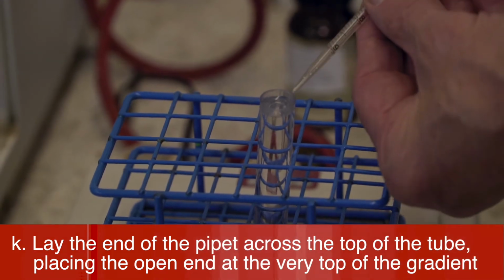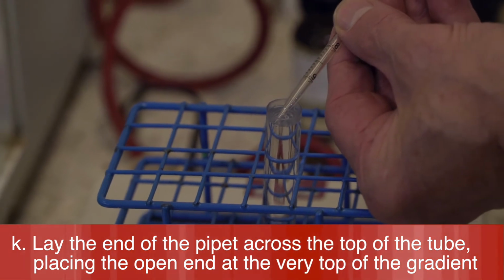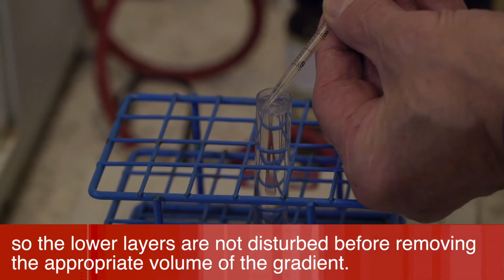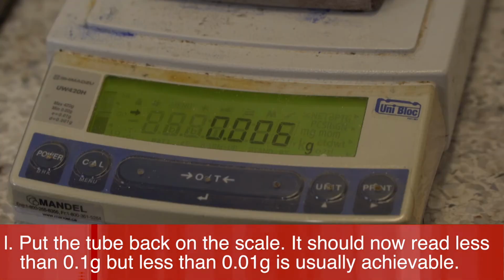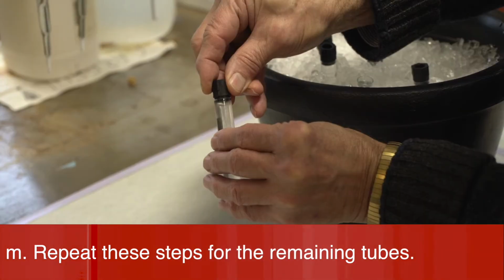Lay the end of the pipette across the top of the tube, placing the open end at the very top of the gradient so the lower layers are not disturbed before removing the appropriate volume of the gradient. Put the tube back on the scale. It should now read less than 0.1 grams. But less than 0.01 grams is usually achievable. Repeat these steps for the remaining tubes.